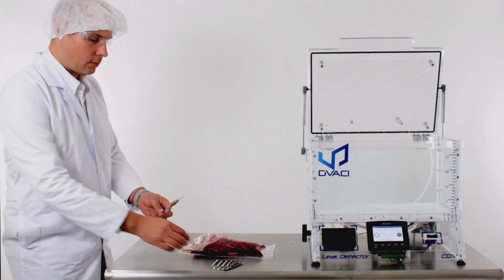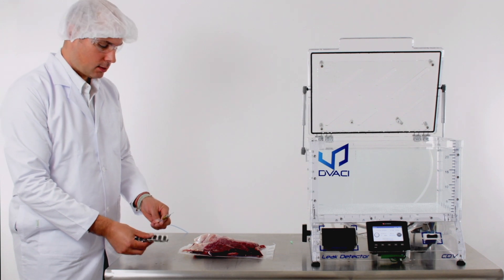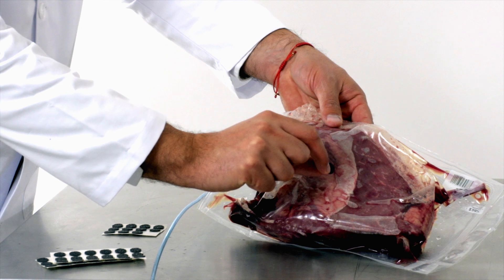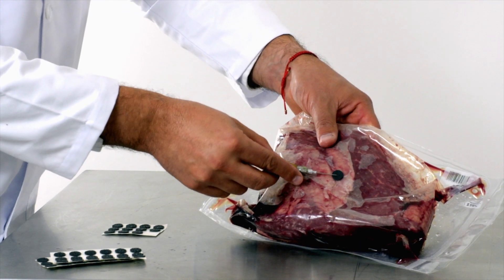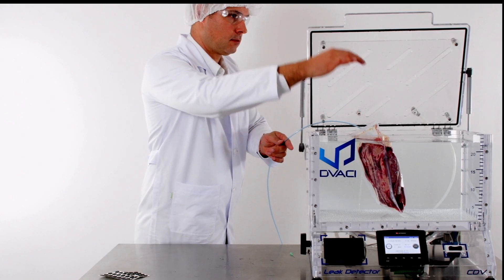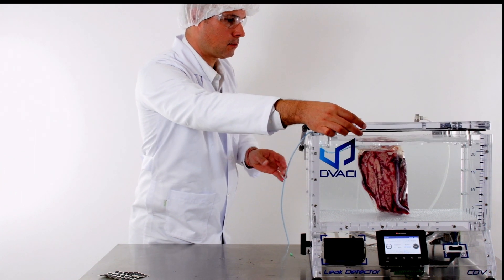Next, we will use a needle and patch kit. This method helps to detect leaks in packages that are vacuum packed but have very little or no air at all. We place a patch and needle so we can inject air into the package inside the chamber. This method will not use vacuum but rather positive air pressure inside the package.